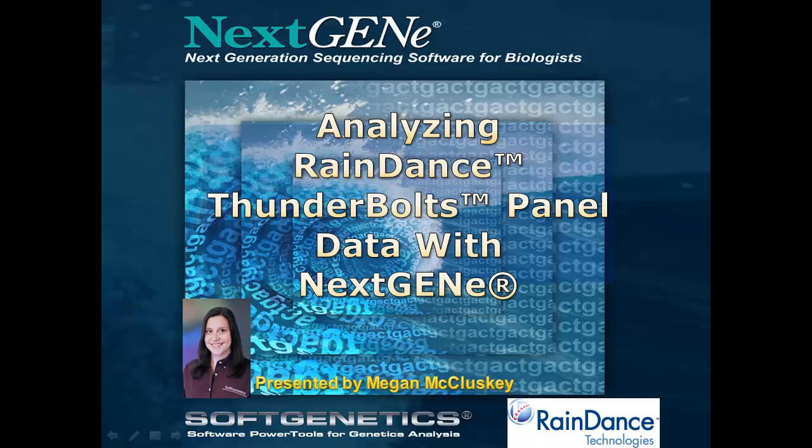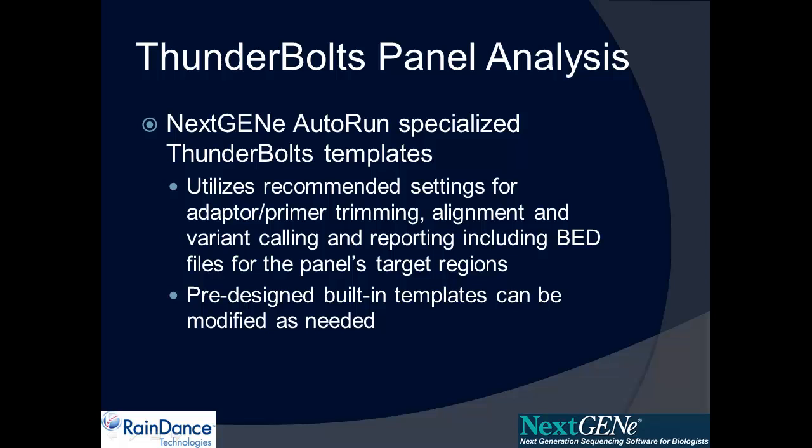This webinar will discuss some specialized features for analyzing RainDance ThunderBolts panel data with NextGENE software. NextGENE now includes built-in templates to simplify project setup for the analysis of the RainDance ThunderBolts panel data.